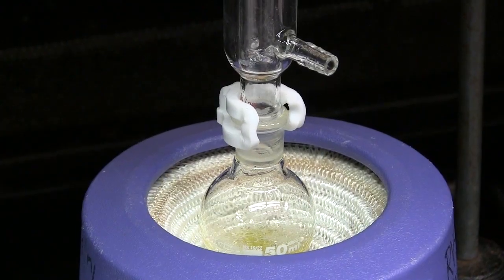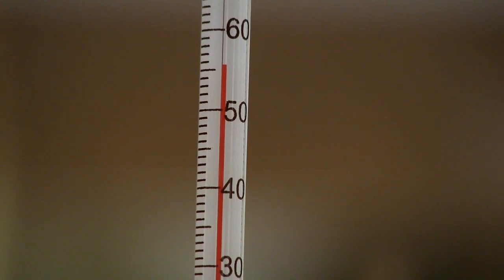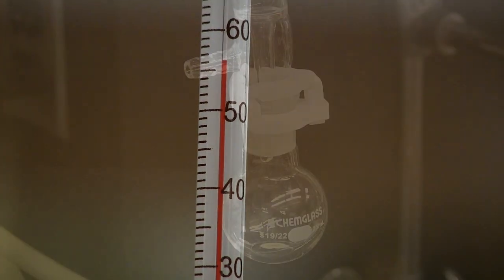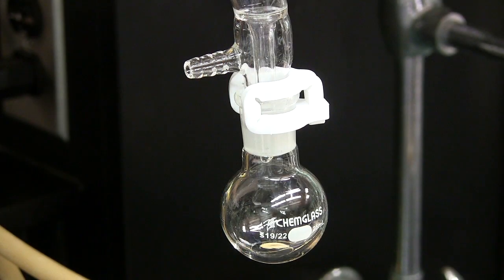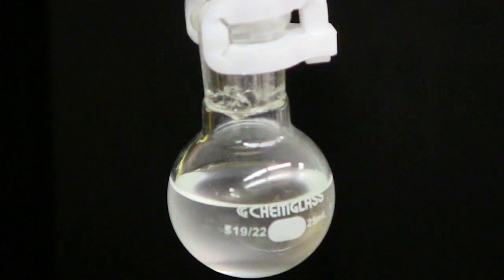Adjust the heat so that the product is distilling over but the temperature at the stillhead does not exceed 120 degrees Celsius. Stop collecting product once the drip rate drops noticeably or when the stillhead temperature cannot be kept below 120 degrees Celsius. This will likely occur when you have collected 10-15 ml of liquid.